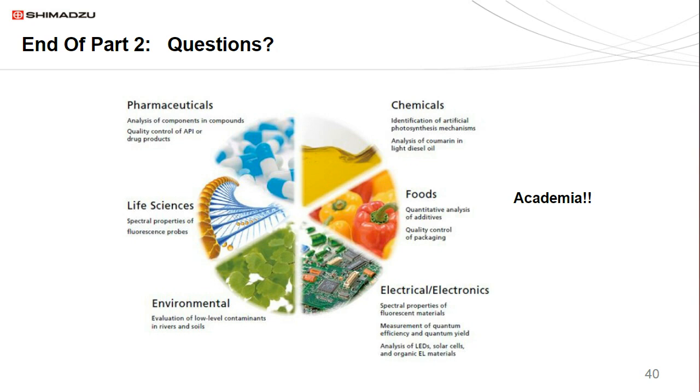Three-dimensional gives you a larger view of what's going on in its entirety, but it takes longer. You have to collect a series of scans, and the data can be somewhat difficult to read. Like I mentioned, it's a bit like reading an X-ray. You have to get used to how peaks become asymmetrical and how mixtures can sometimes form together before you can really read anything. It's very difficult to quantitate information from a three-dimensional scan, but it gives you a very good conceptual, qualitative view of what's going on.